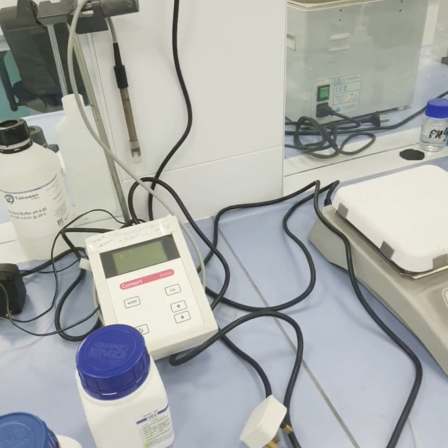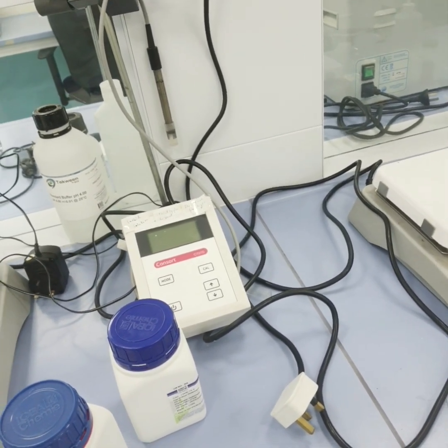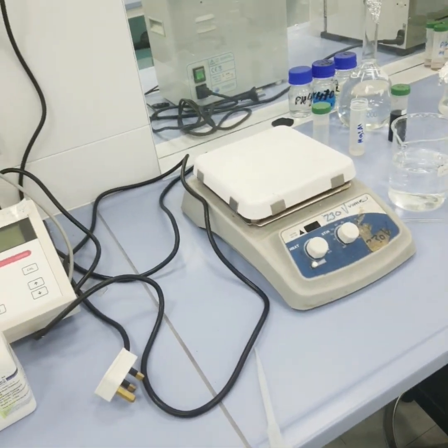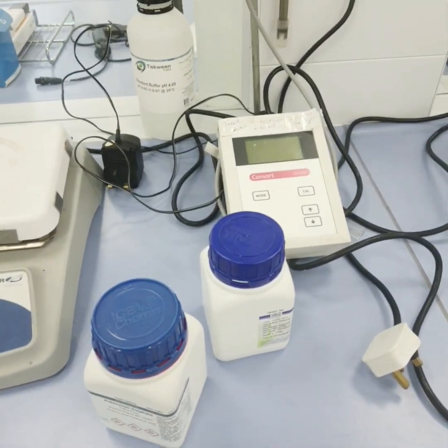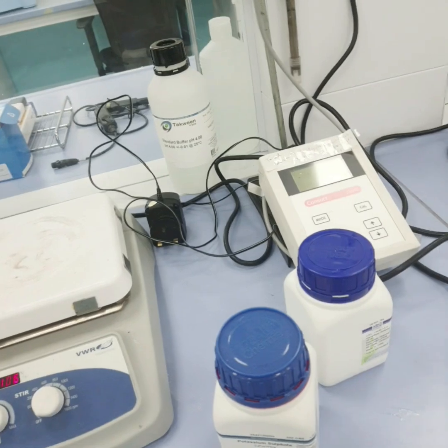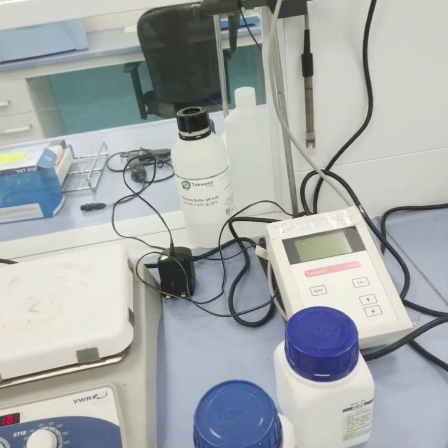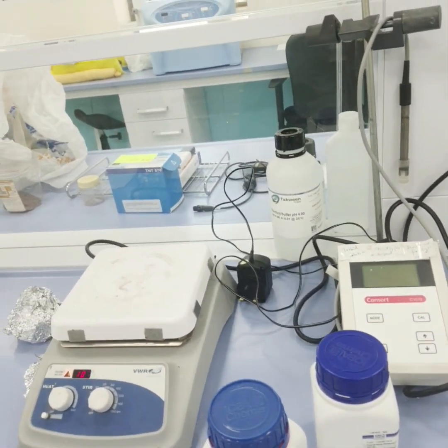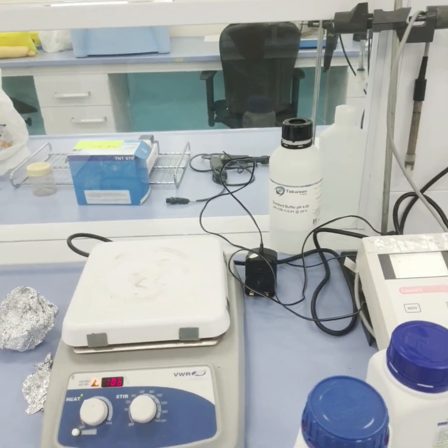or you can say compound forming agent like EDTA, which is called, sorry, it's not a dye, it's called the titrating agent, EDTA, ethylene diamine tetraacetic acid. So this one is titrated to find out the unknown concentration of the calcium and magnesium.